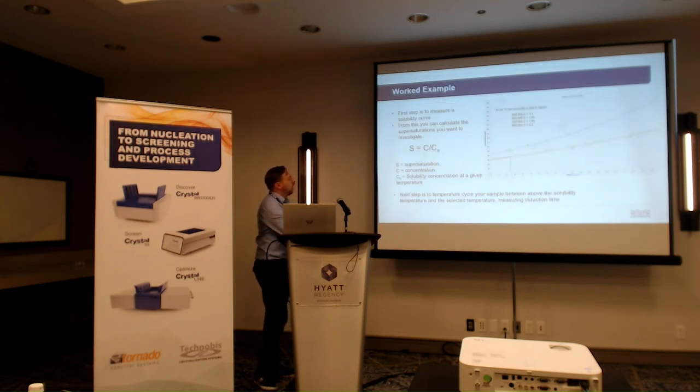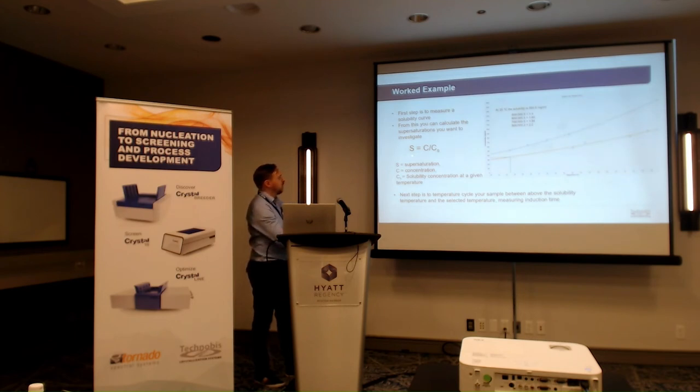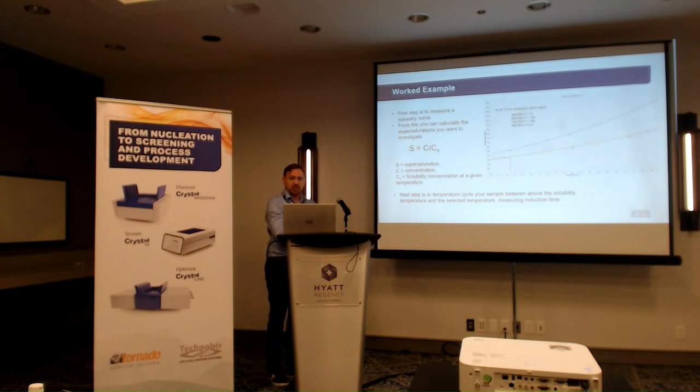So, what I want to do is just go through a worked example. Initially, what you have to do is collect your solubility curve. This is because you need to determine what supersaturation you're using and how you're defining that. So supersaturation is defined as concentration divided by the solubility concentration at a given temperature.